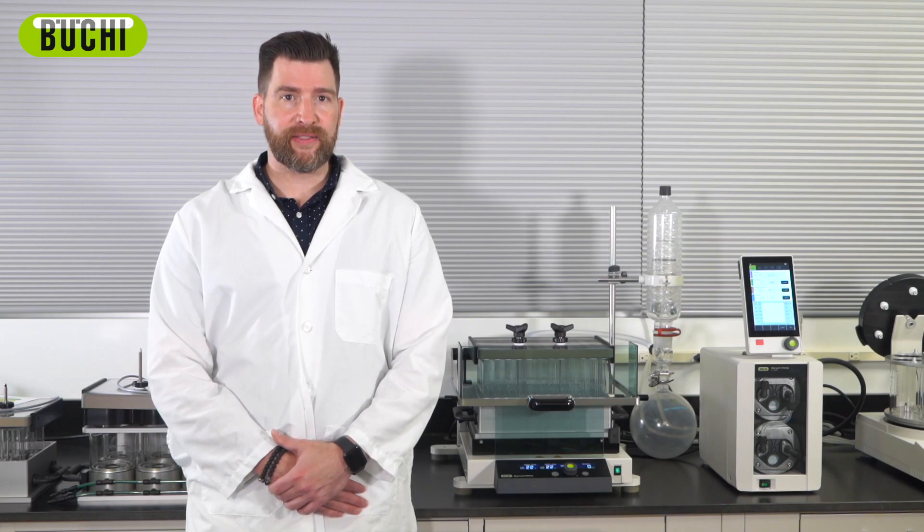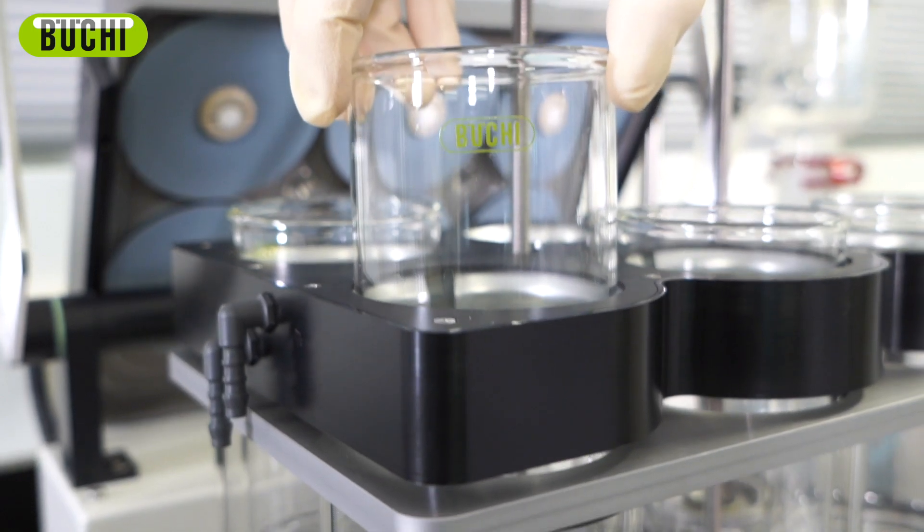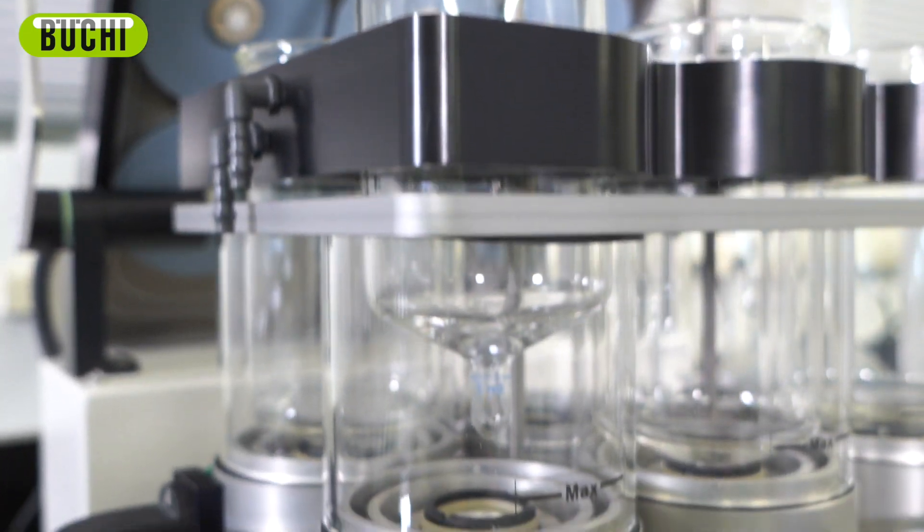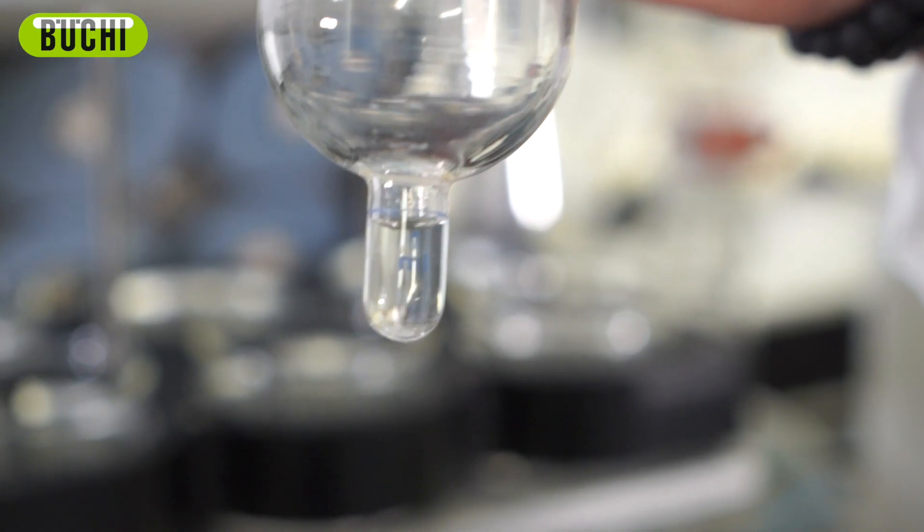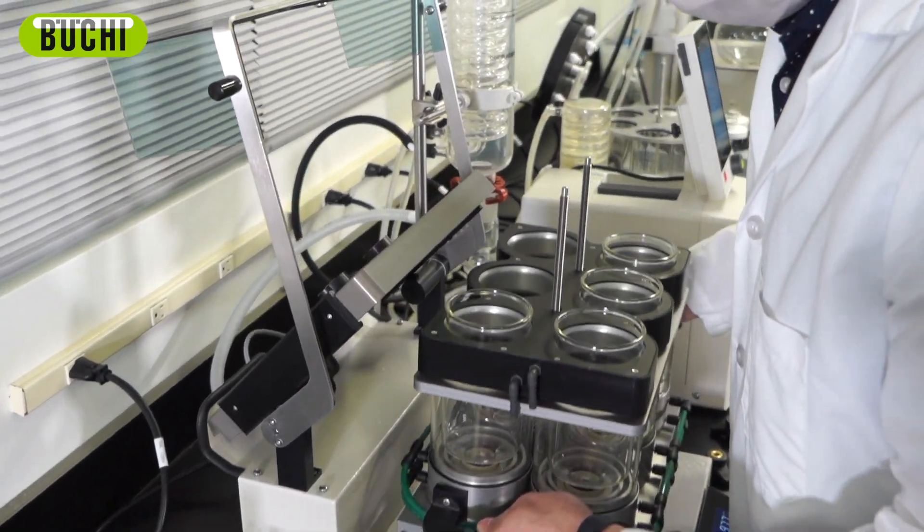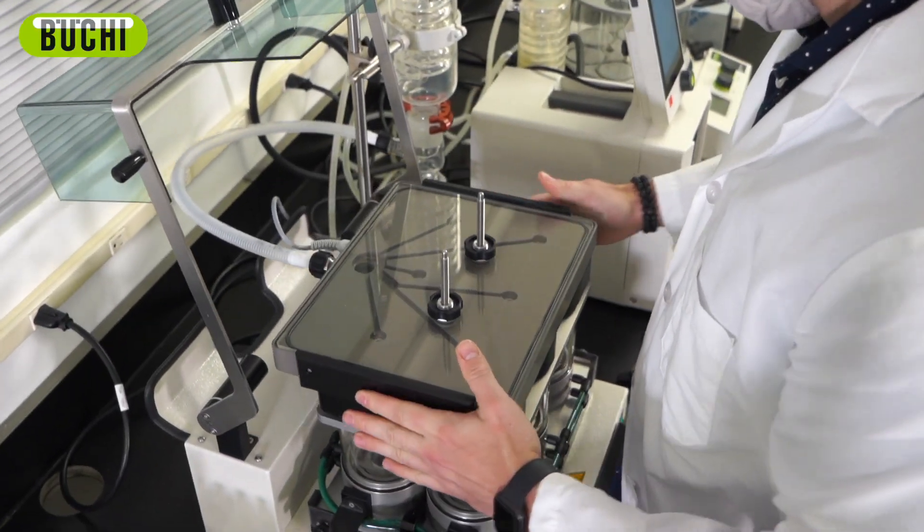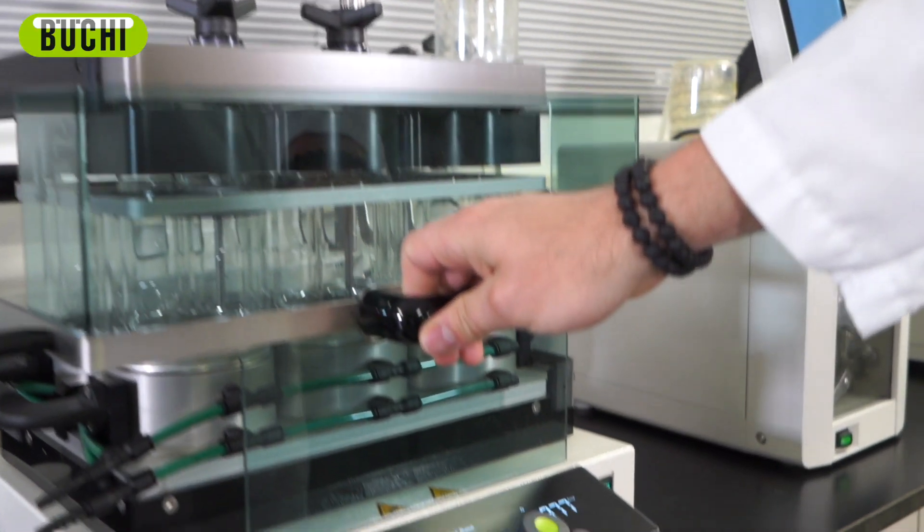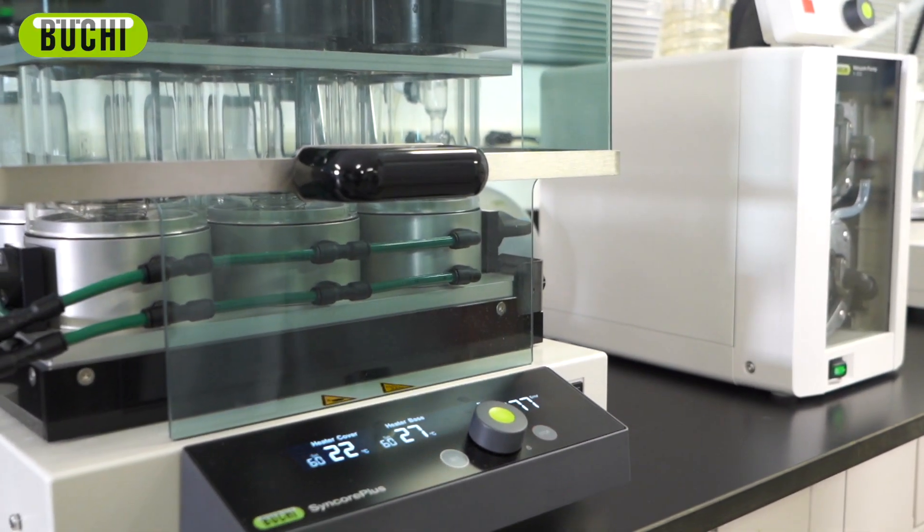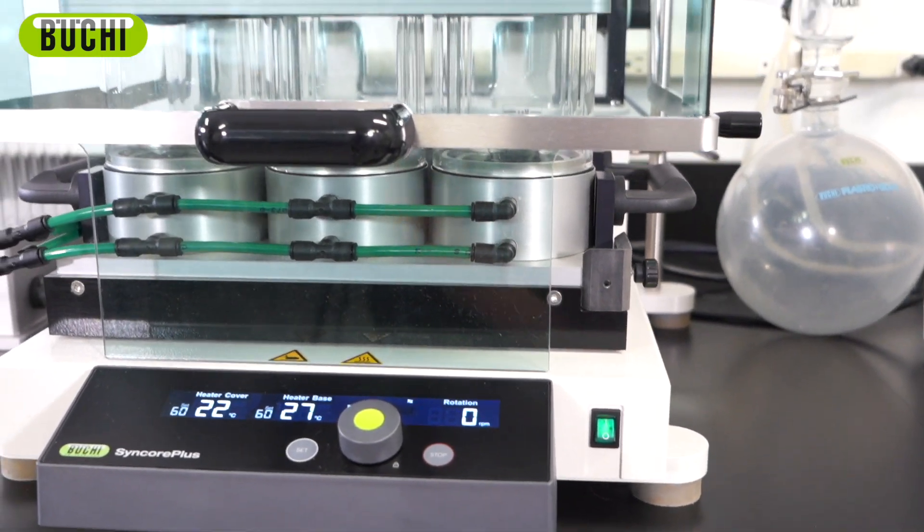To differentiate the two Buchi Syncor Plus units, the Analyst is specifically designed with a cooled appendix, which concentrates the samples to defined residual volumes of 0.3, 1, or 3 milliliters. This configuration is predominantly applied to environmental applications and concentrations of extracts in food quality control. As a pre-analytical step, the Syncor Analyst drastically reduces extensive time used in your everyday prep work.